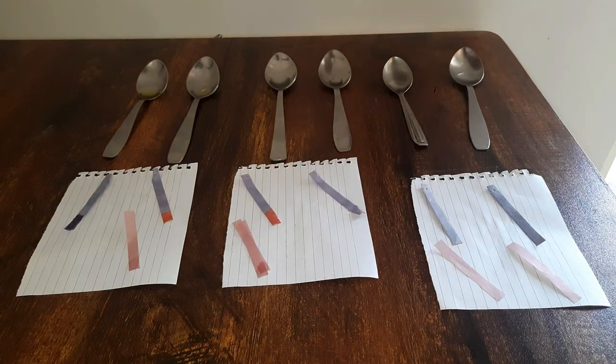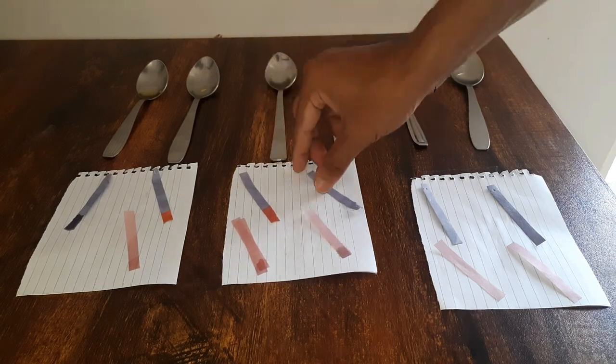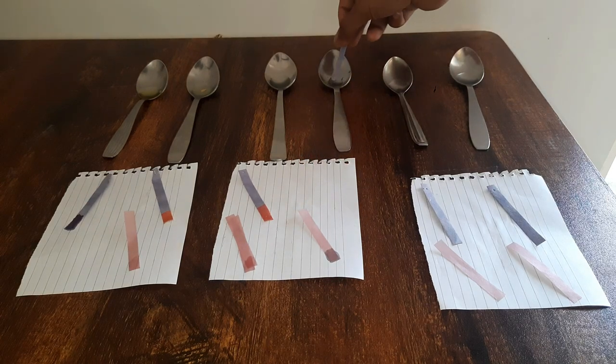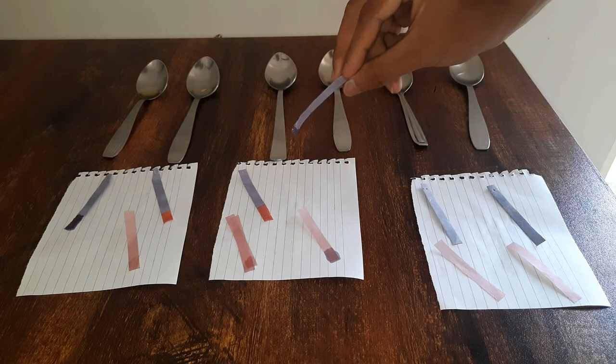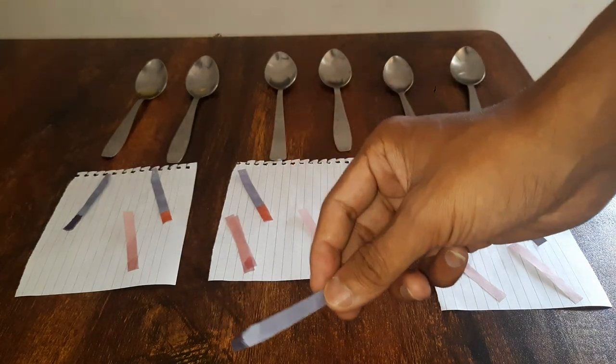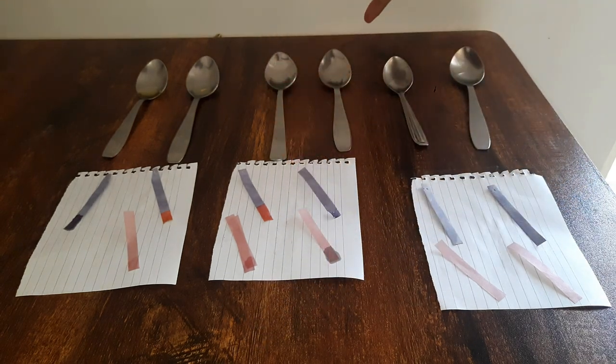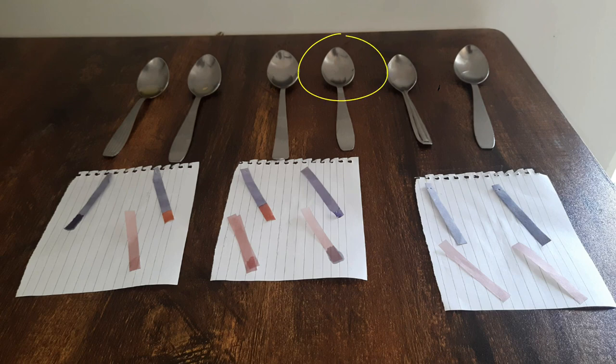Now this is oil. Again, no color change for red litmus paper, and also no color change for blue litmus paper. No change in the color of the red litmus paper tells us it could either be acidic or neutral, but there was no change also in the blue litmus paper. So that means this substance is neutral — it is neither acidic nor basic.